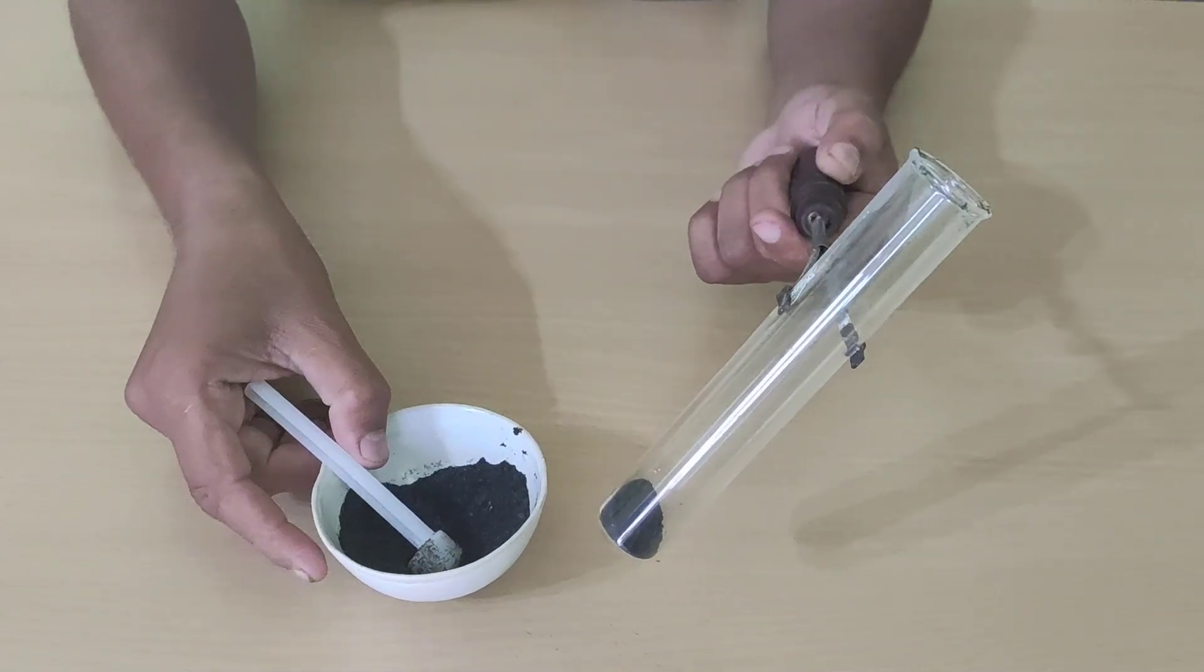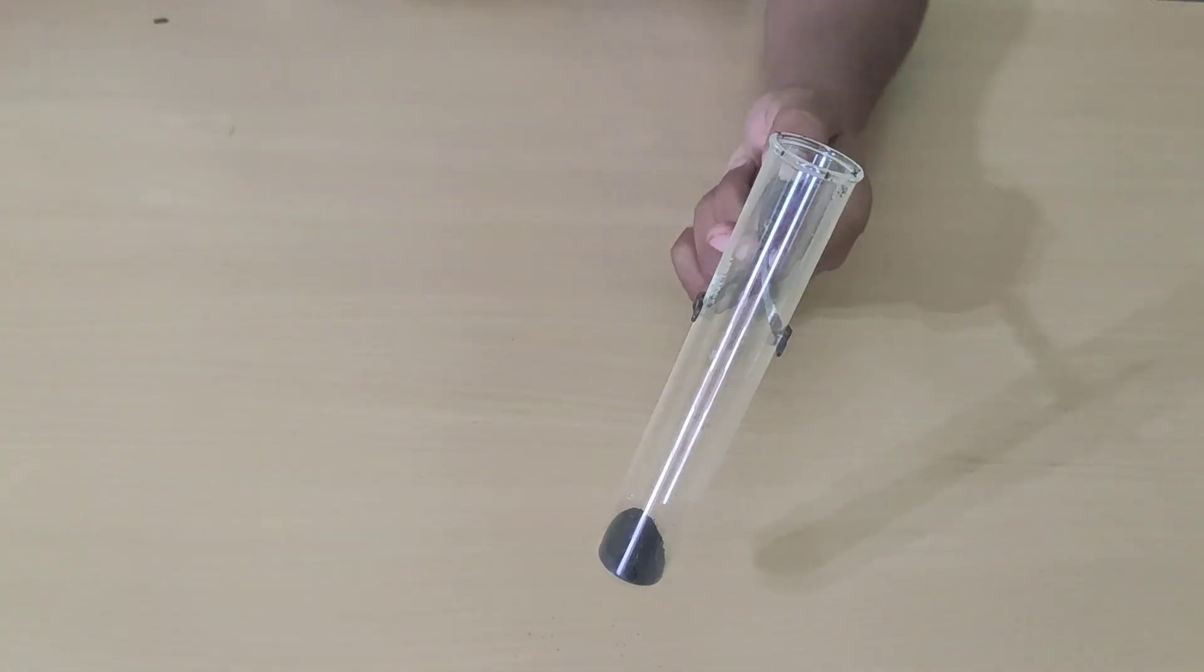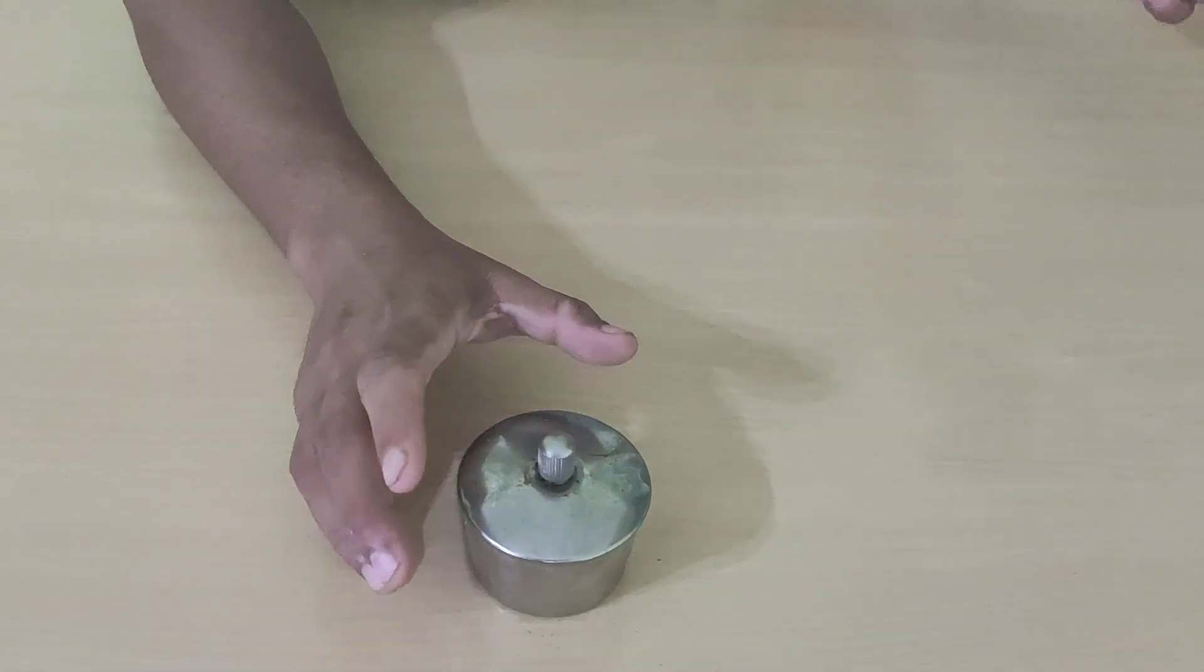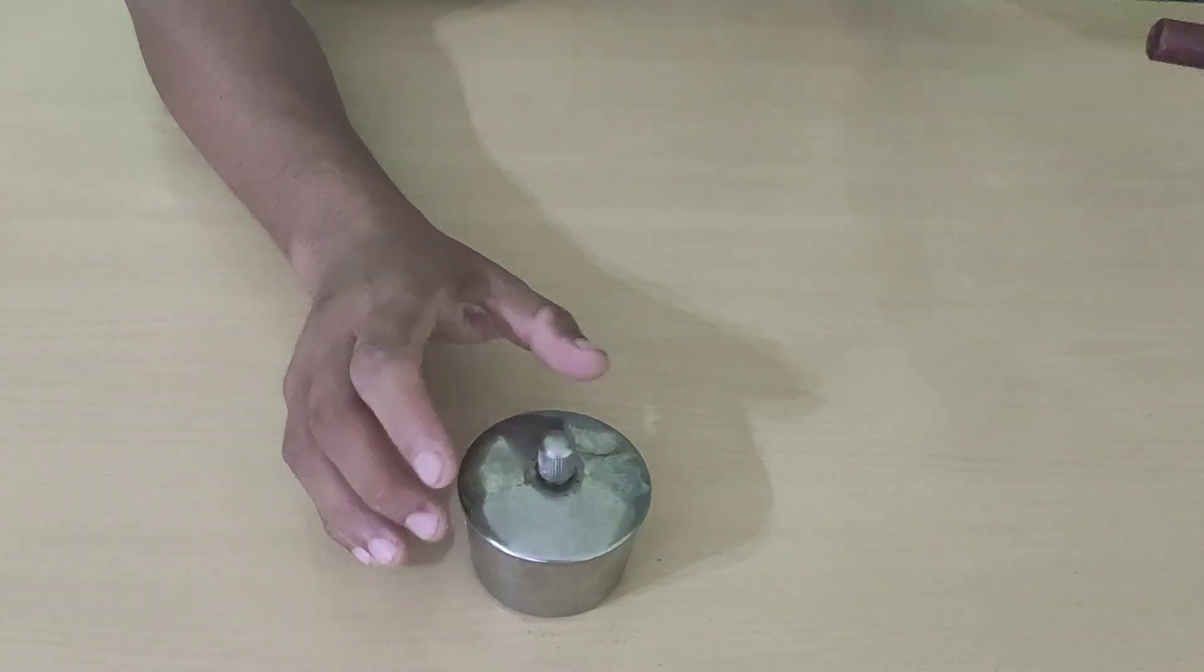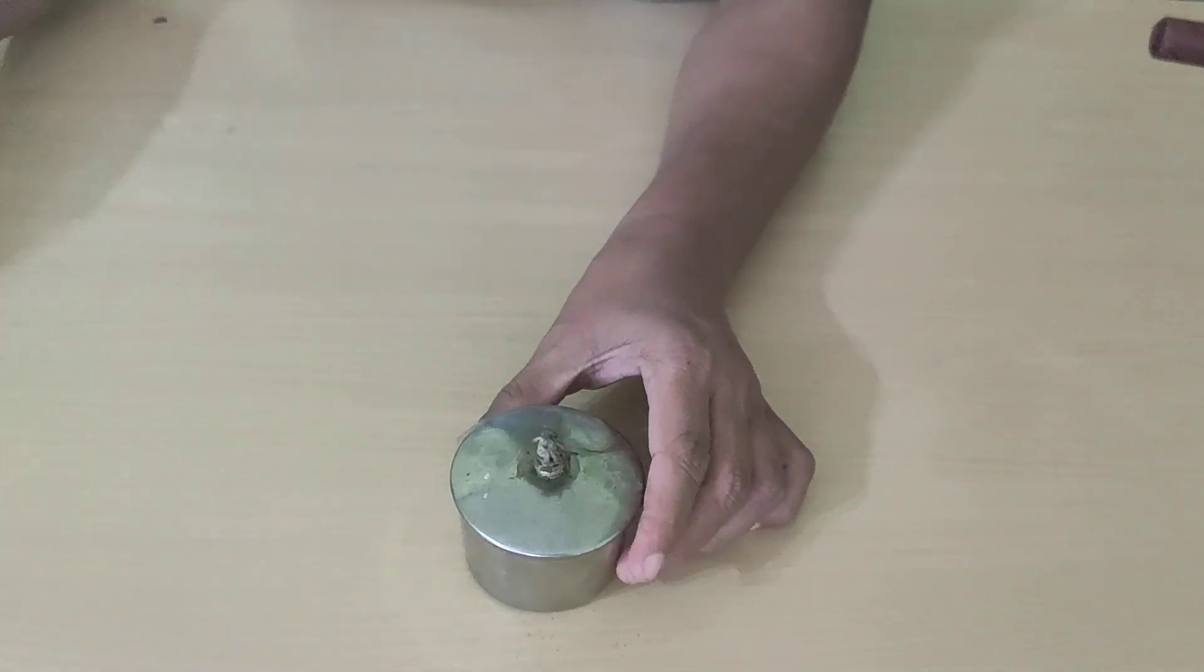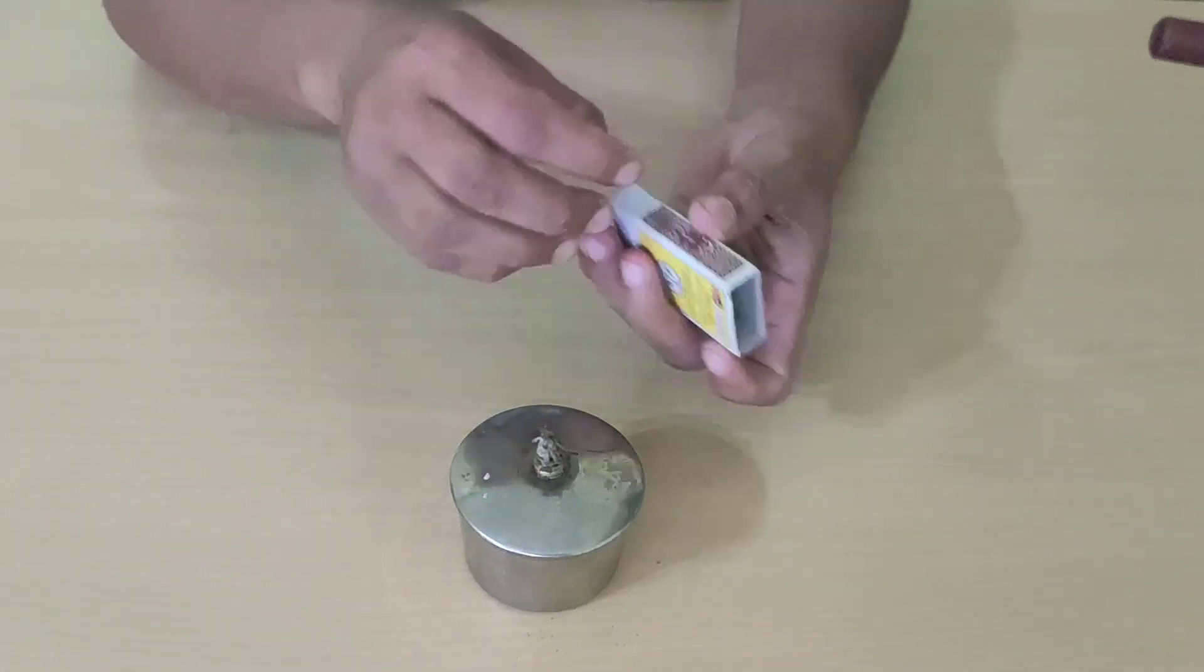Now, we will heat this potassium permanganate powder on a spirit lamp. You may either take a candle also. I have taken a spirit lamp for heating this test tube.